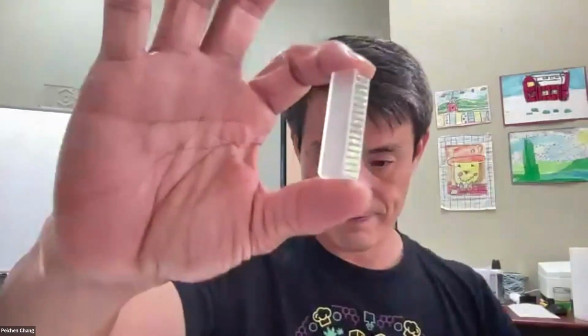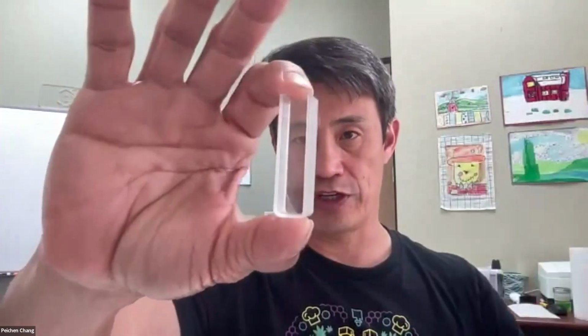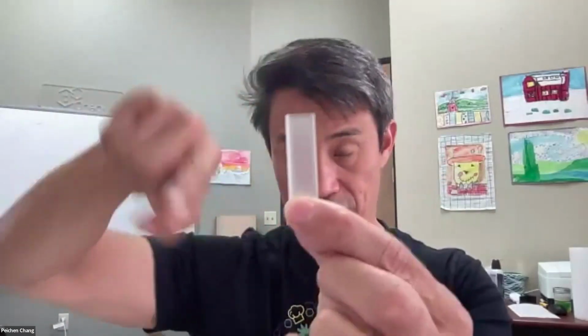Standard spectrometer cuvette. A standard spectrometer cuvette looks something like this. This one happens to be made out of quartz. This one has what's called a path length, where the light goes through it from this side to this side, of 10 millimeters.